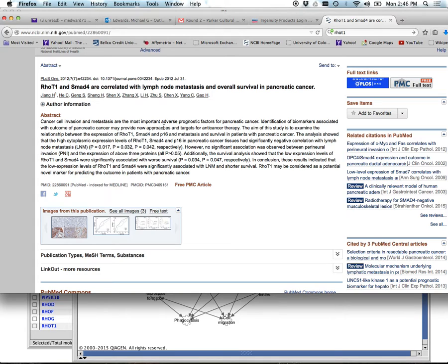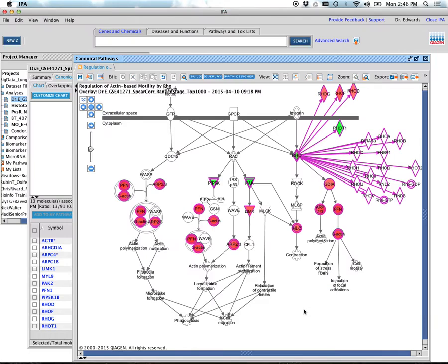Right? This is important. Not only did it rob a bank, or was around a bank that was robbed, it's probably one of the good guys. It was probably trying to help, right? This is probably a tumor suppressor that we've just now identified with lung cancer. And I doubt anybody else out there knows this. We just figured out something that no one else in the world knows just by messing around with a bunch of numbers. That's what you're looking for when you analyze these things.